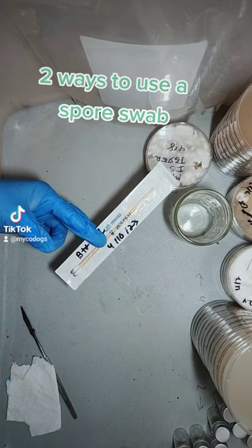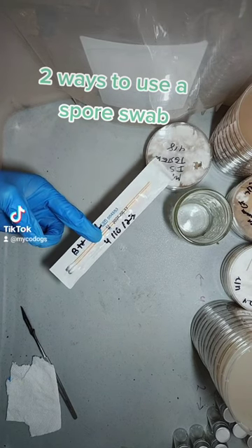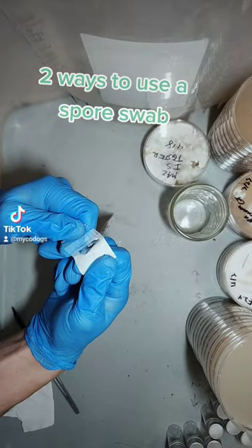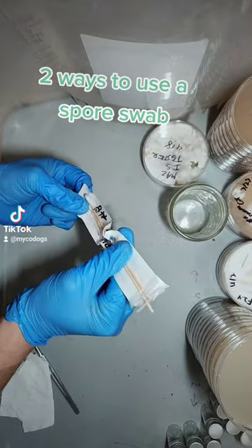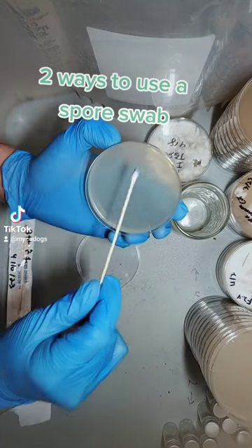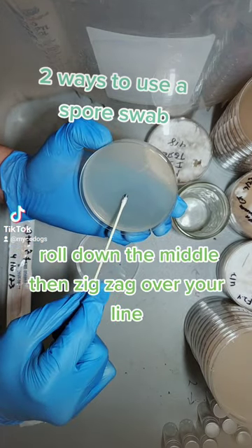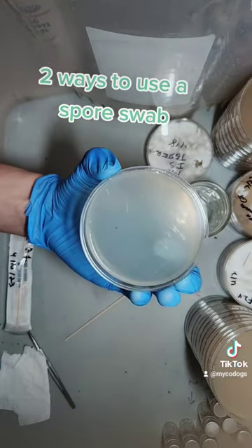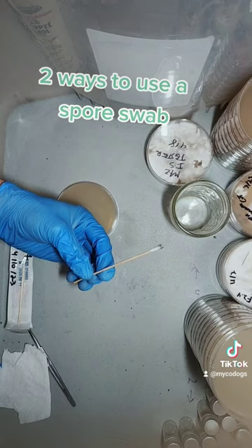The first method is the simplest method, but you have to throw away the swab when you're done. Crack it open, slide it out. Now roll and twist, and then go back and forth. And that's the first method. Now throw away the swab.